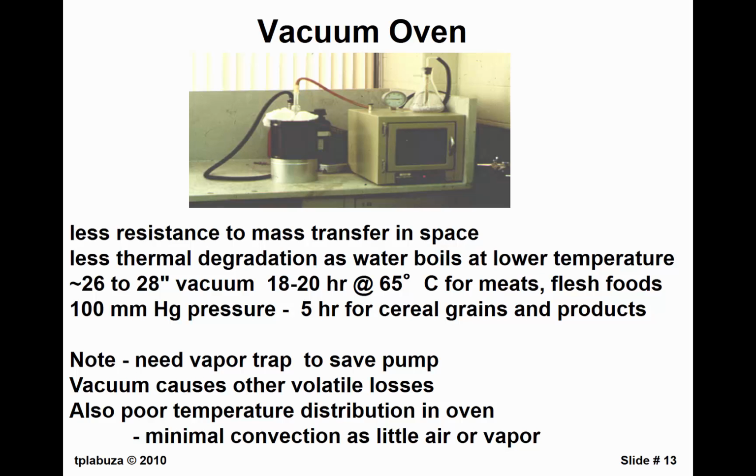And that's what I suggest to people: use only one rack and put most of the samples close together in the center of the rack rather than hitting the walls. And people don't like to hear something like that because it's a pain.